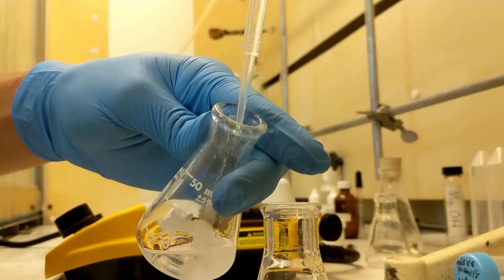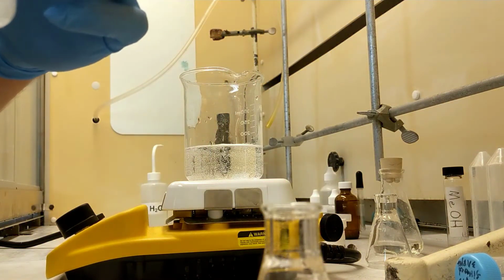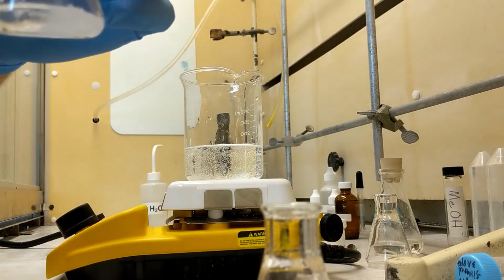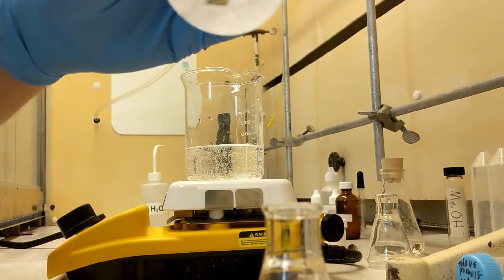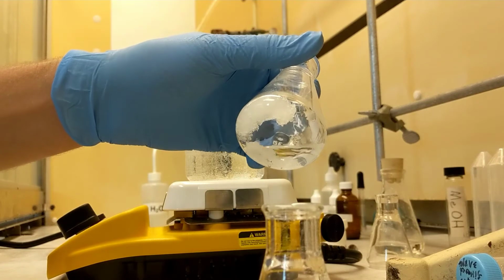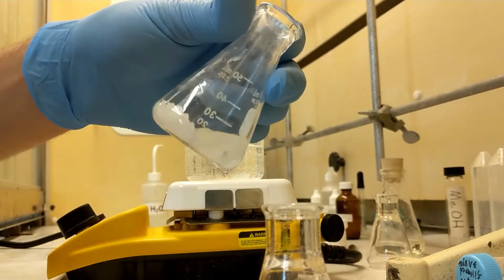So my goal is to not grab any of the drying agent. So I do that by just moving the flask around, trying to get the drying agent stuck on the sides. You see how it's stuck on those two sides right there? Oh, how it's stuck on those sides there. So I'm going to move the liquid to another side and pull it off.